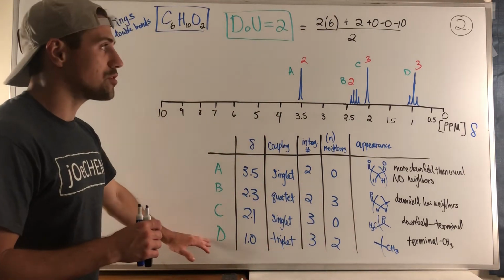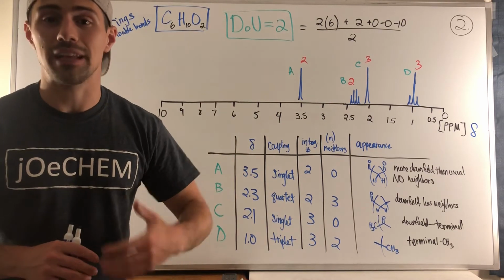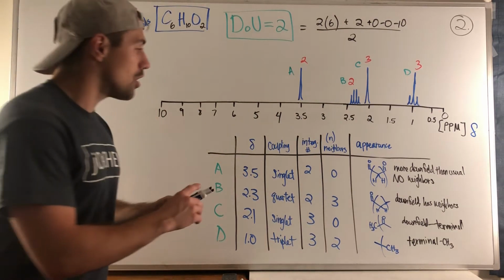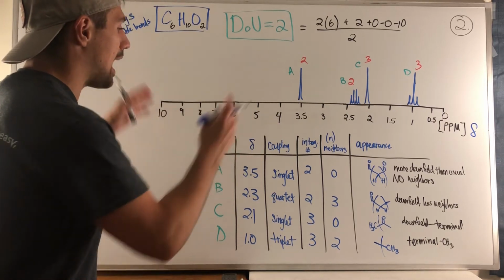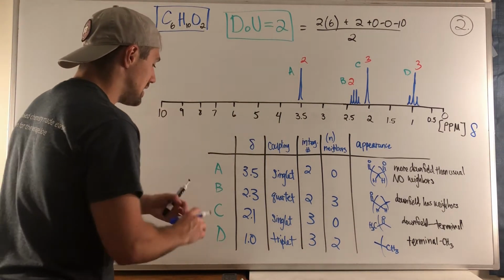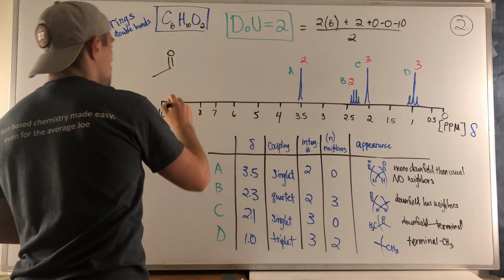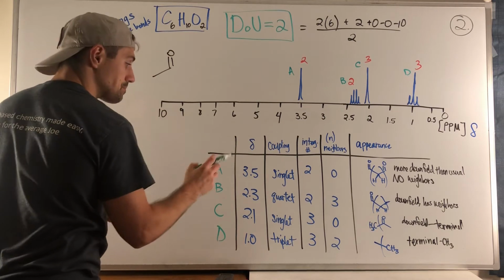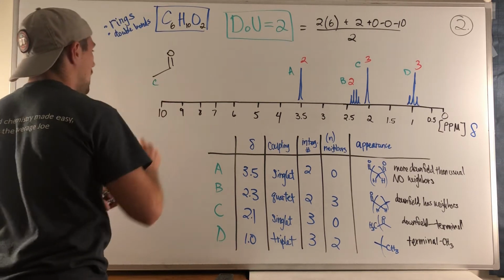And I hope if you saw D, it's Old Faithful. It's that terminal methyl group, the terminal CH3. So in taking this information and drawing a structure, I think the ends, we can at least with A and D, put something together like this. So this, I believe, explains C. This explains C. I'm getting all mixed up with how I've labeled this.